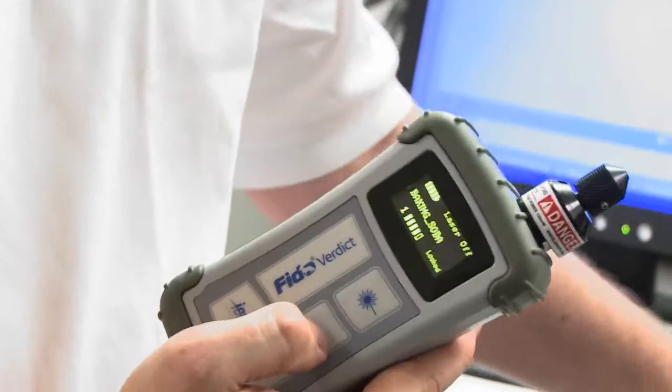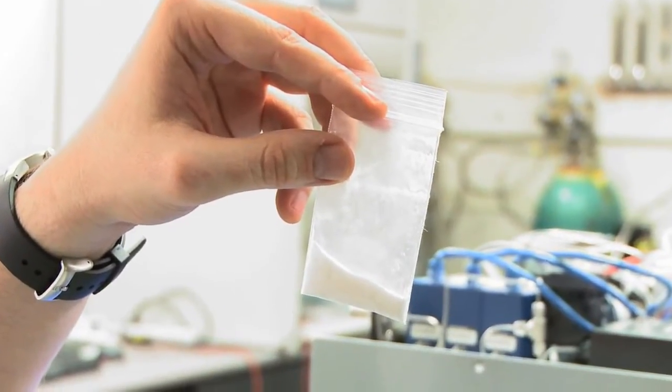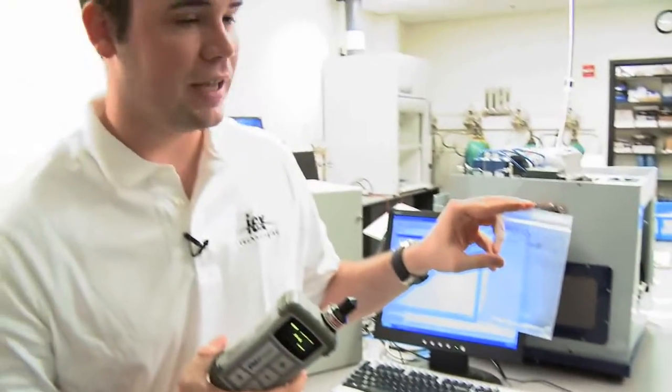Baking soda would be a useful thing to distinguish as a white powder from perhaps other illicit substances such as narcotics or cocaine. Our next sample is ammonium nitrate. It's a more suspicious substance than the baking soda, though not necessarily illicit. Ammonium nitrate is fertilizer, but is also used in many homemade explosives and itself as an explosive, though you need a higher explosive to detonate it.